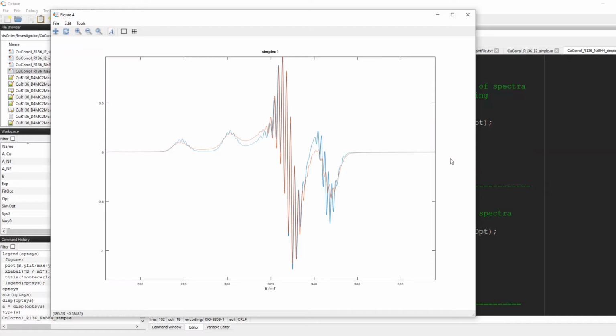If you find problems in different functions and you know some programming and know how to help, you can of course clone the EasySpin repository from GitHub and improve it. I would be grateful if anyone can improve the code and make all parts of EasySpin work correctly in Octave. I think it is important to provide open source or free options to researchers in places that cannot always afford a commercial program like Matlab.